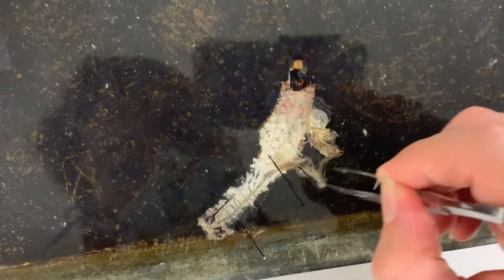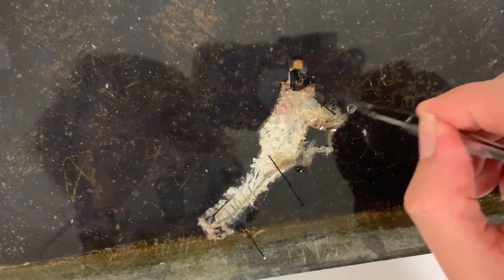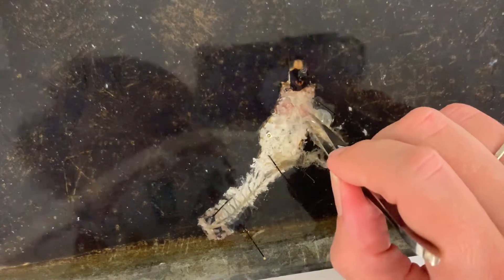All of this is the midgut. Here's the gastric caeca attached to the crop.